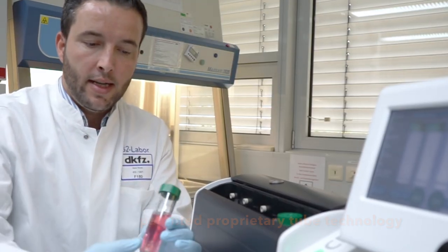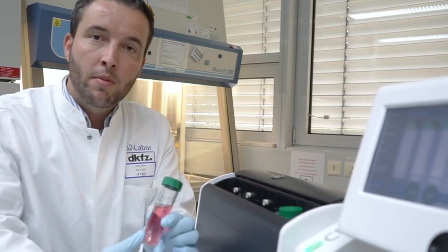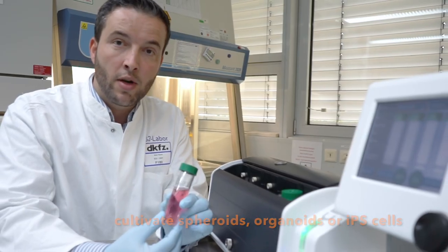CERO is using patented tube technology which enables you to cultivate ideally your spheroids, organoids, or IPS cells.